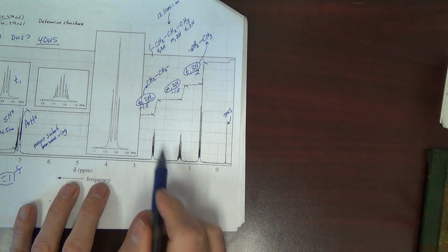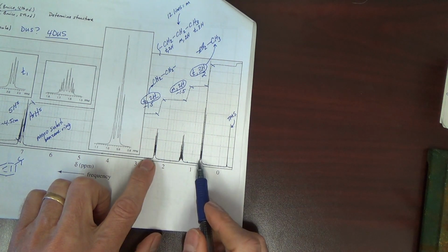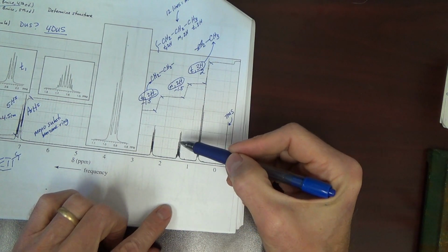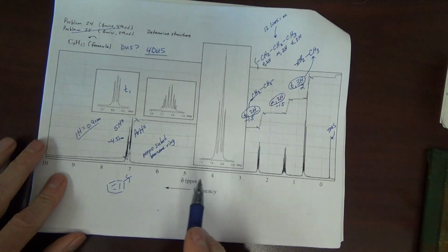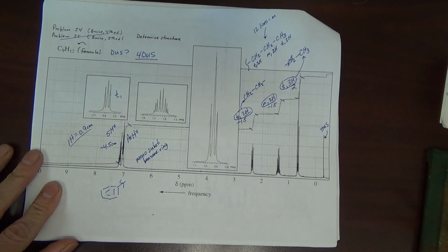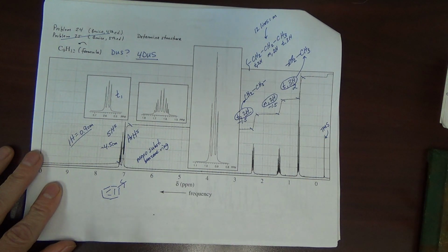The signals tell us that's what we have. Triplet, 2 triplets, one for 2H, one for 3H, and then the multiplet. Now you can look at the lines of the multiplet. Do we see 12 lines? Theoretically, we expect 12. You may not see 12.